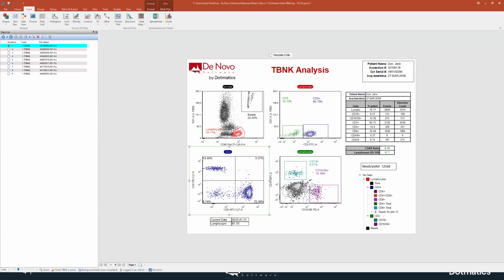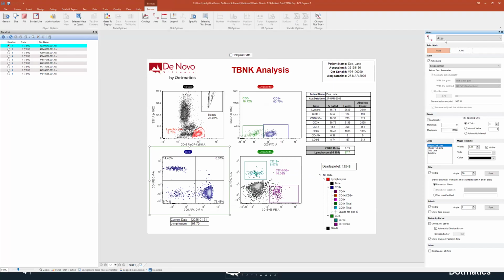So normally to adjust these, or to adjust any other scaling settings, you would come to the plot, go to Format, Axes, and then change the scaling here. You could uncheck this, choose Use the Value, and then use the scaler to move it up and down to change that setting. But we put these slider bars directly in the plot so that you can now just adjust it straight from the plot without having to come over here and do that.